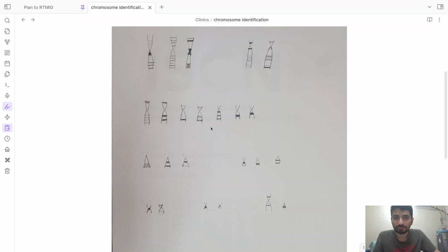So on a metaphase spread, when you are seeing a chromosome with a distinct box band on the Q arm, you could call it either 11 or 12, but you should wait till you identify all the four chromosomes of this nature, and then you can differentiate which ones would be 11s and which ones would be 12s based on distance from the centromere to the dark box band.